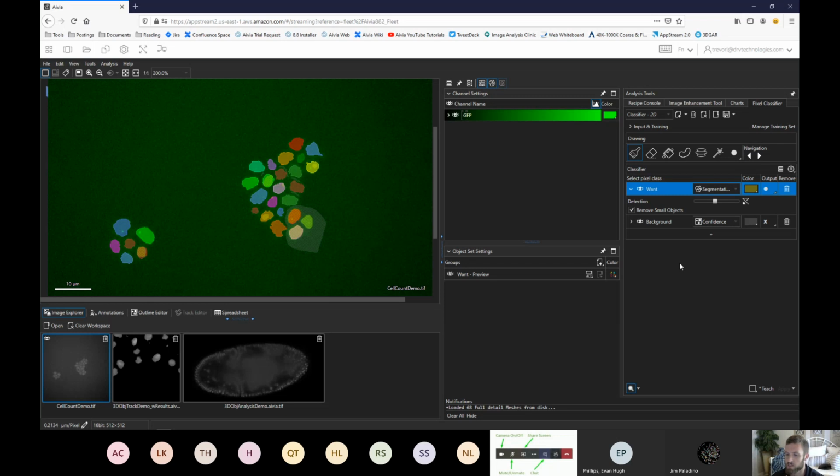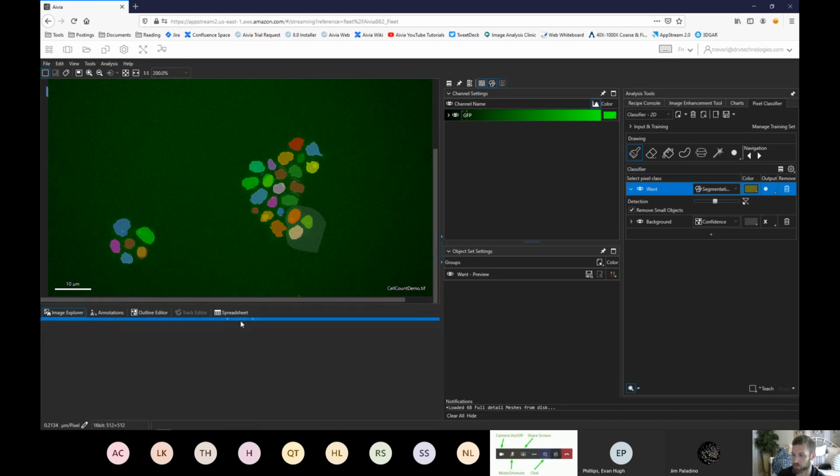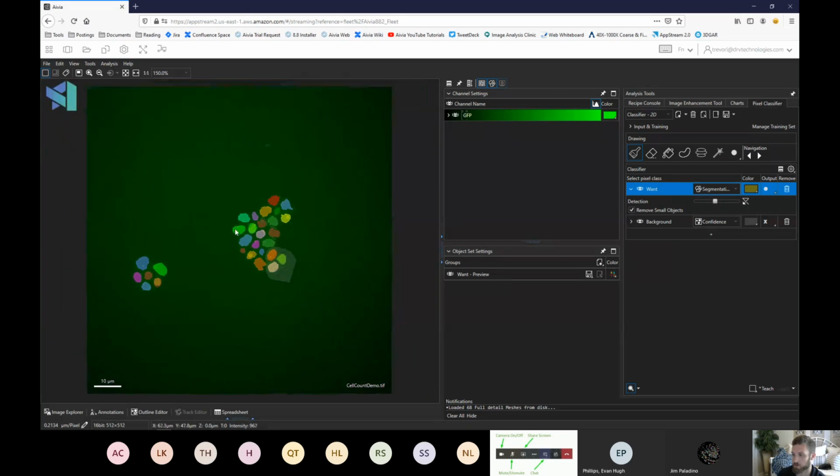All right. Finally, let's save all of our work. Just like we did last time, let's say we want to save a screenshot of what these results look like. We can click this panel divider here to collapse it. We can scroll with our mouse wheel a little bit maybe to make sure it fits.